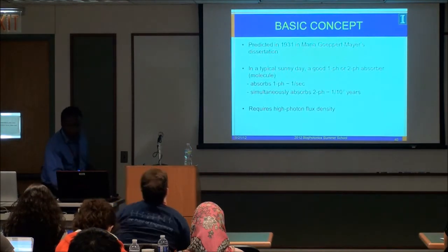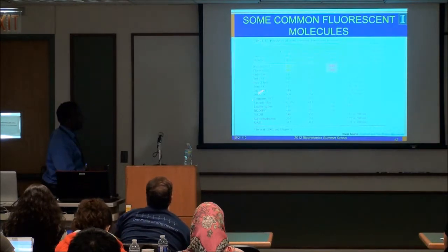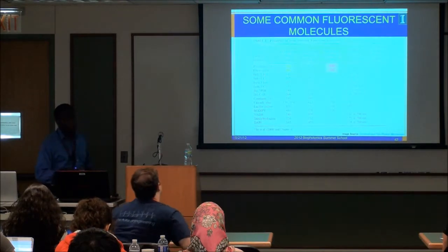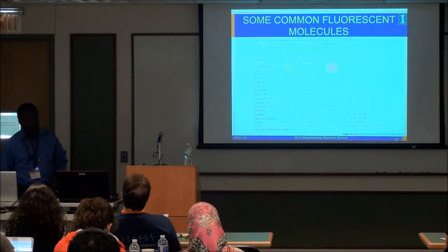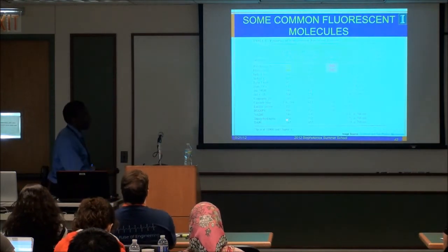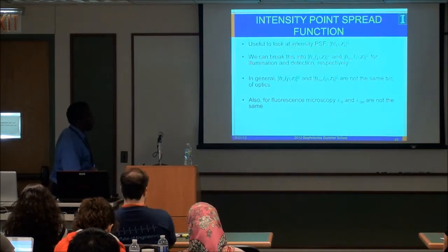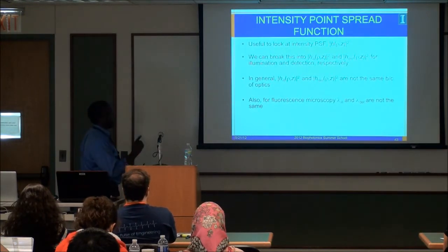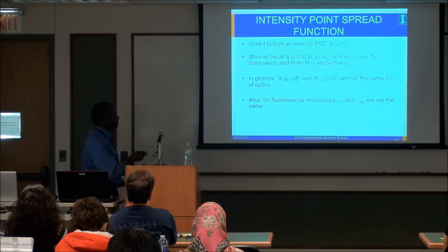All right, so we went over all this. I'll just mention this quickly. There's a lot of different types of dyes, fluorescent and what have you, and these are the one-photon absorption peaks. The two-photon absorption peaks aren't exactly where you would expect them to be because the quantum mechanical selection rules are different. But this table gives you an idea. One can think about now comparing the resolutions from these different techniques. Okay, it's particularly the advantage or the relative trade-offs using nonlinear methods.